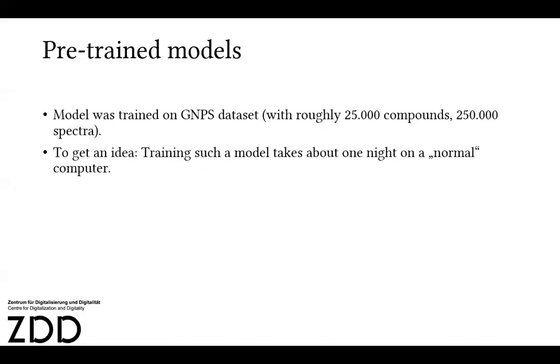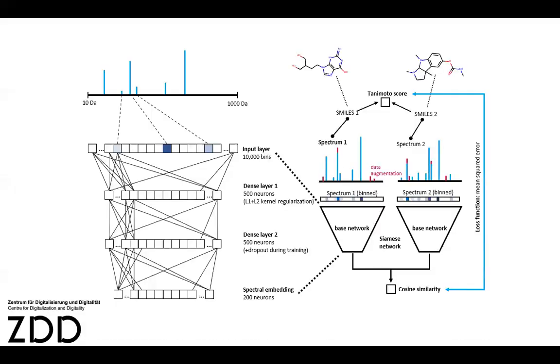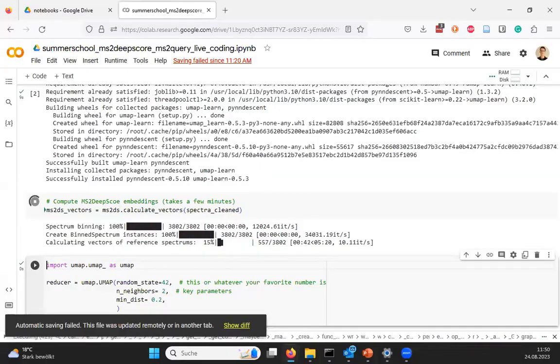I will just go back to slide 4. So what we actually do is feed it all the spectra in our data set now, every one of them, and then we get some numbers out. These are the numbers at this point, which we now will store. And this will take some time.